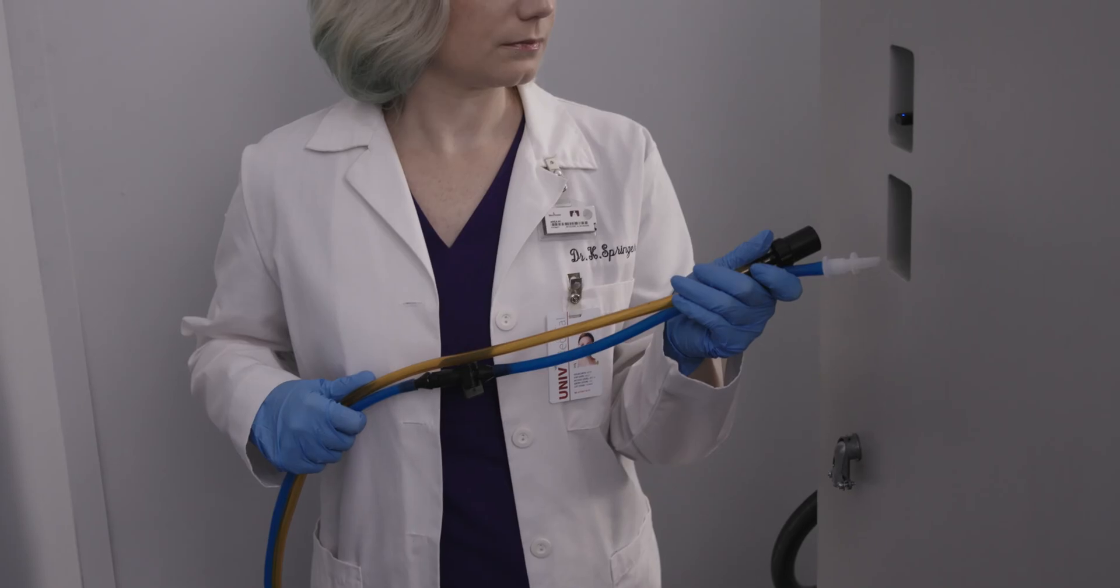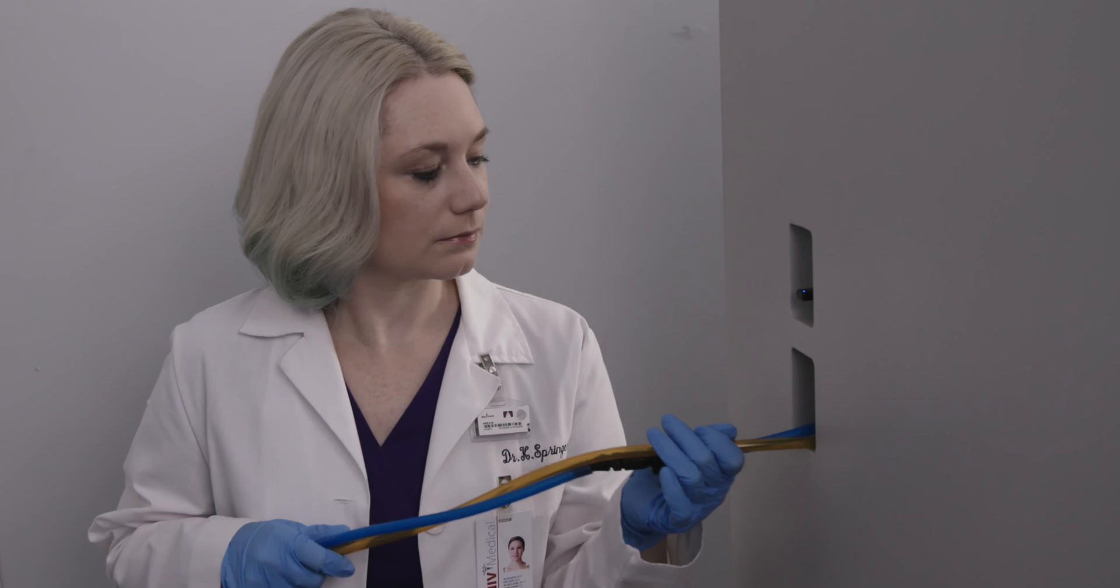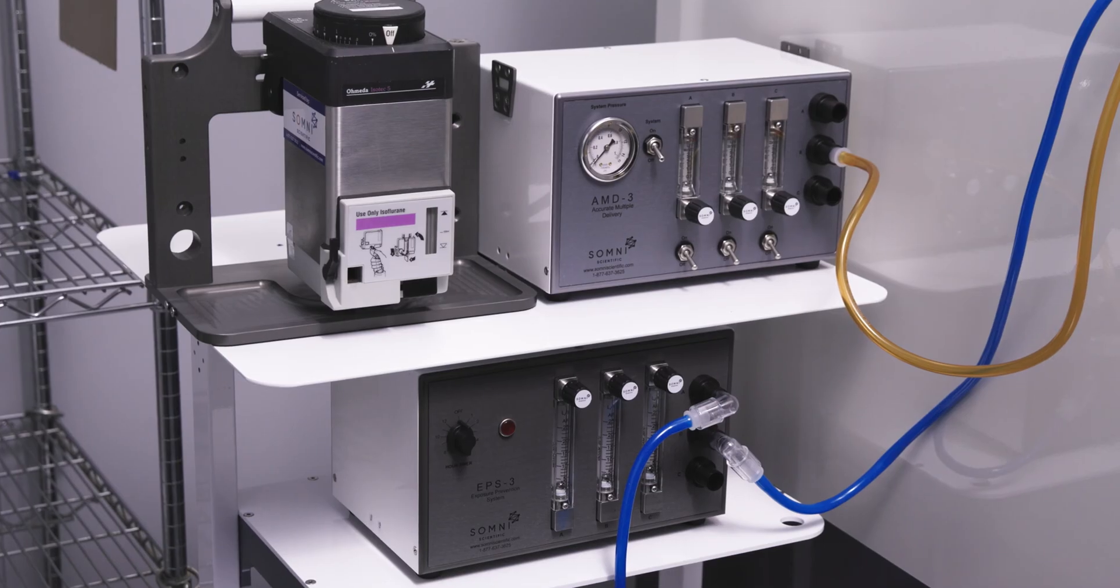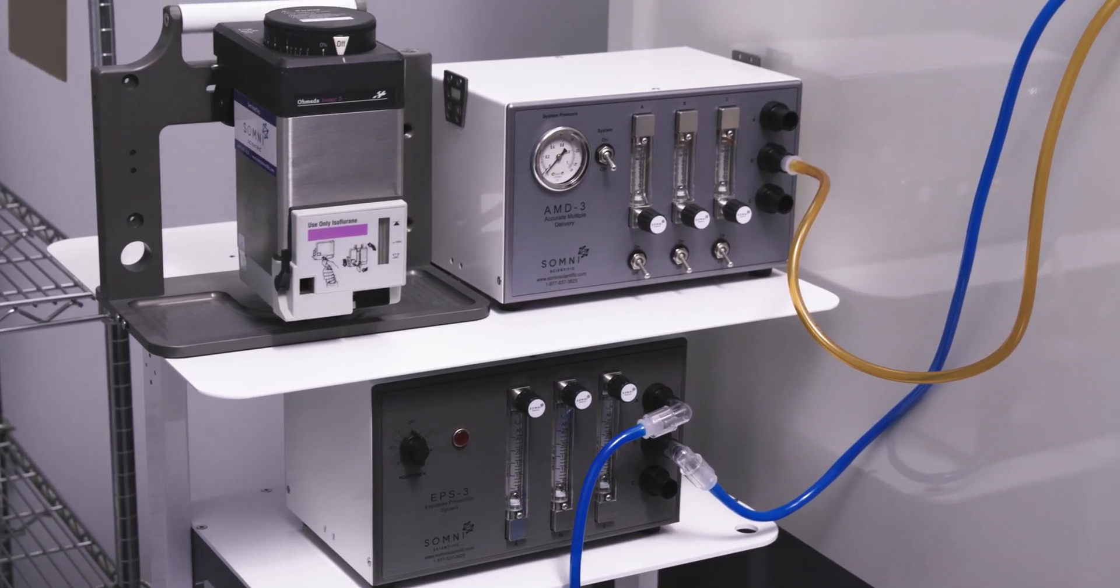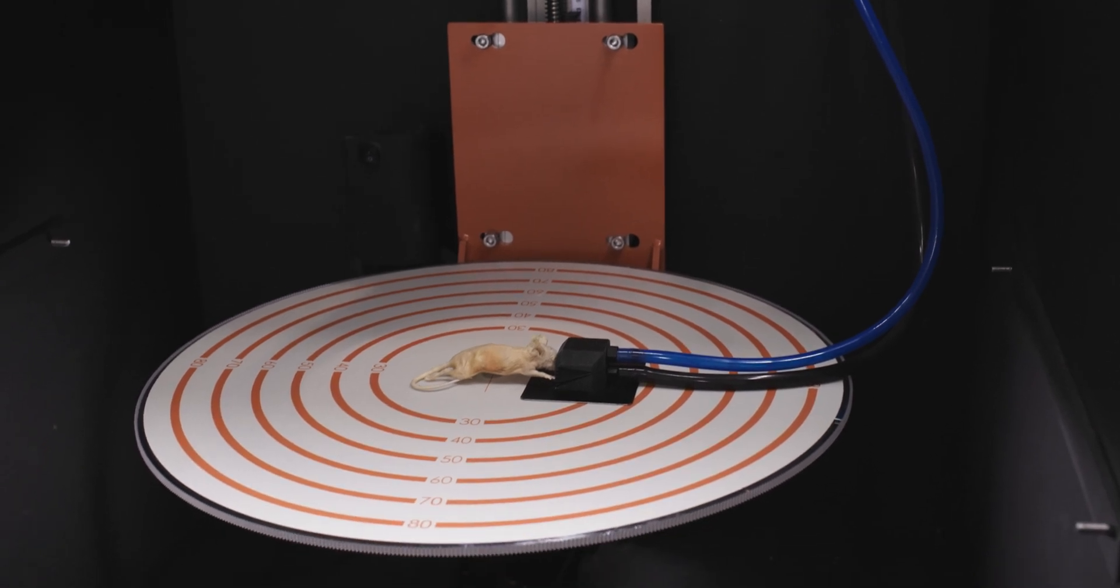For monitoring processes or delivering anesthesia, a side access port provides a safe method to introduce cabling or tubing into the internal chamber without risk of external radiation exposure. The anesthesia system, comprising of both isoflurane delivery and scavenging, comes direct from the nose cone.